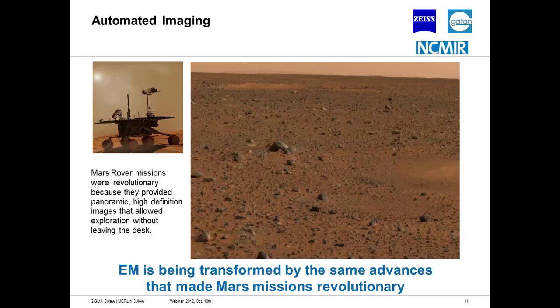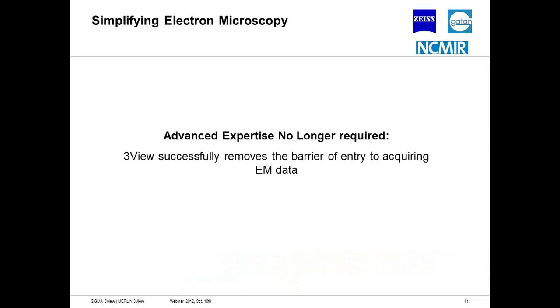Because the imaging is completely automated, we can set this machine up to run overnight, and it will cut through 50 microns of tissue. When I come back in the morning, I can take my cup of coffee, sit in front of the computer, and scroll through the images one by one. I can sit with my cup of coffee and casually go through the data instead of being in a confined room and hoping that my shot is perfect and absolutely focused. The system does that automatically for us. And I think this will give us great capabilities to image large data sets.